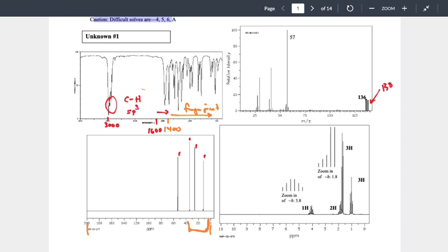Since I'm looking at carbon NMR, if my signals fall in the 0 to 50 range, that would suggest those carbons are just sp3 hybridized alkanes. If I see a peak in the 160 to 200 range, that would suggest my carbon is double bonded to an oxygen. So I'm getting some structural information by looking at those ranges.